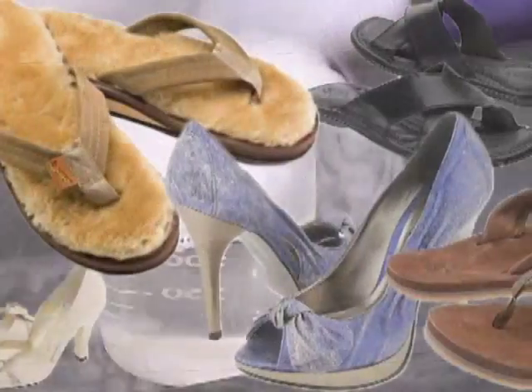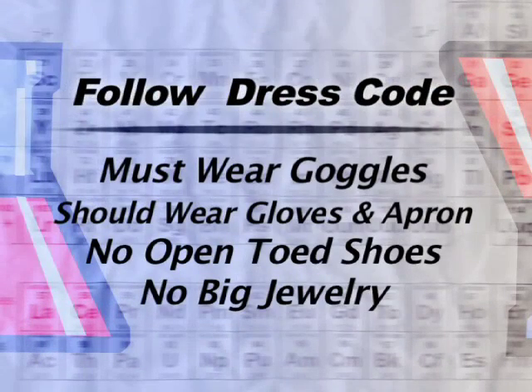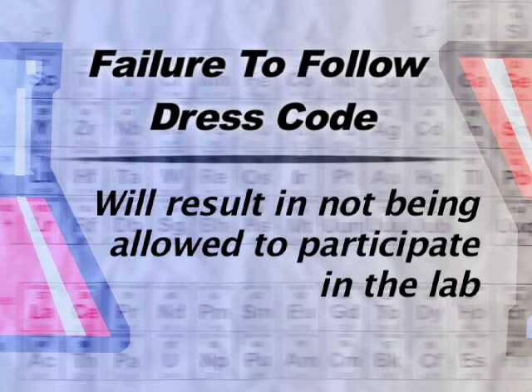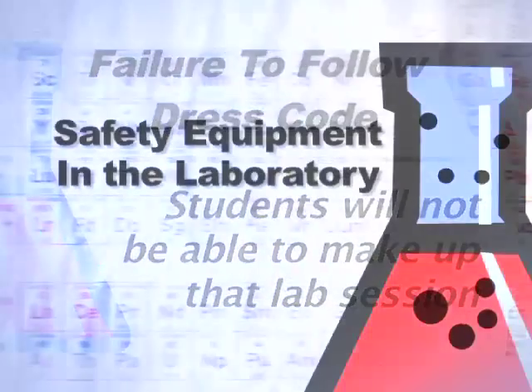These types of shoes expose parts of the feet which may be harmed by the accidental spillage of chemicals or hot liquids. Failure to adhere to the laboratory dress code will result in the student not being admitted to or asked to leave the lab. The students will not be allowed to make up the lab assignment for that session.